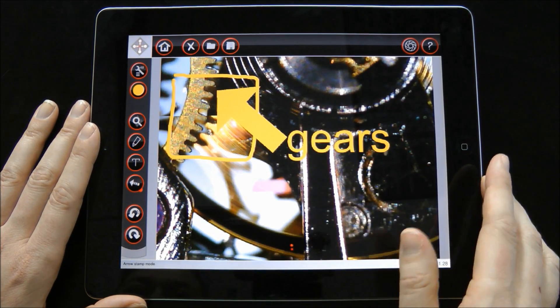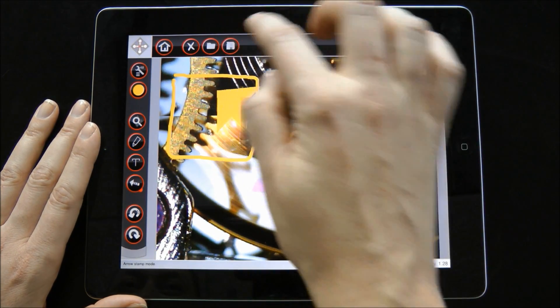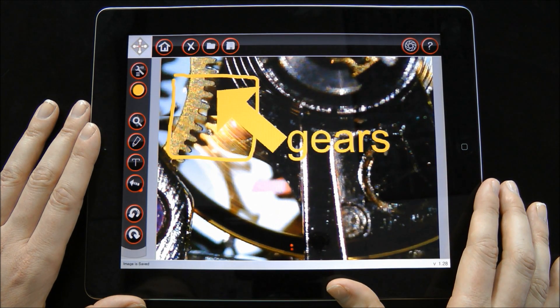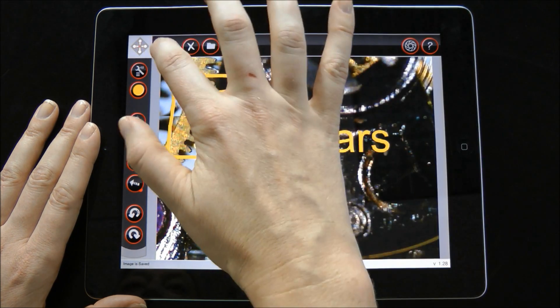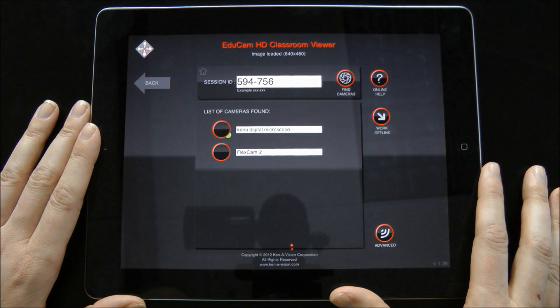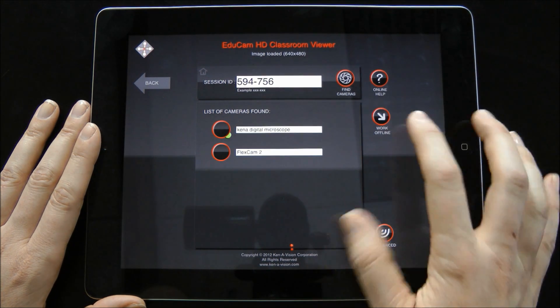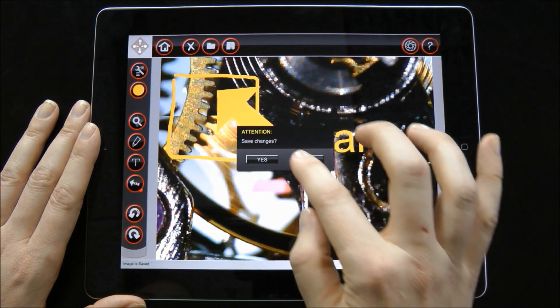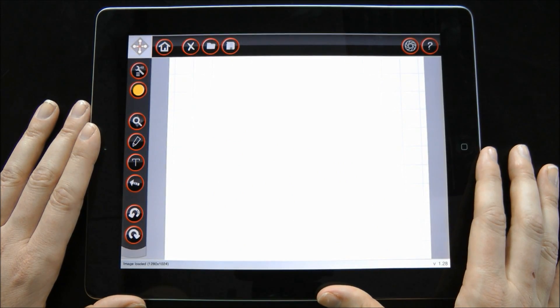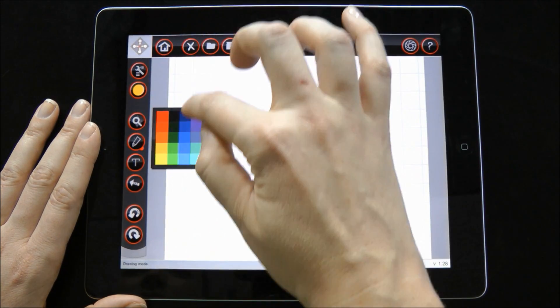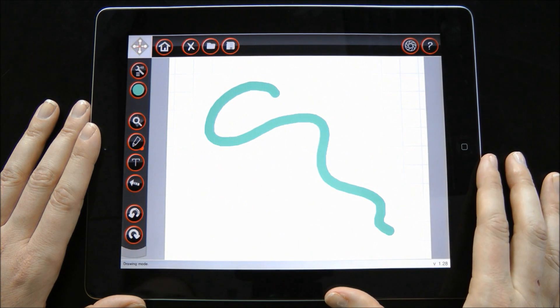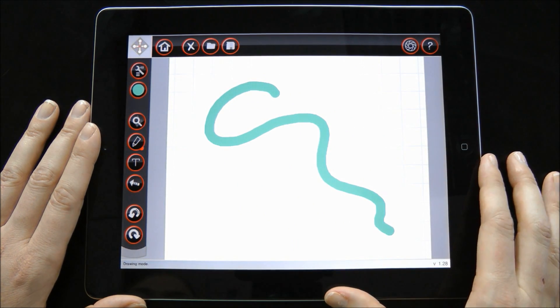To save an image, press the save disk. Going back to the connection screen, we can open a blank canvas to work offline for drawing, or open an image from the gallery.